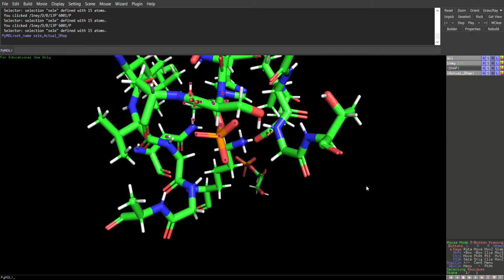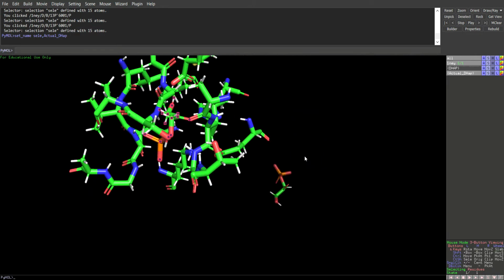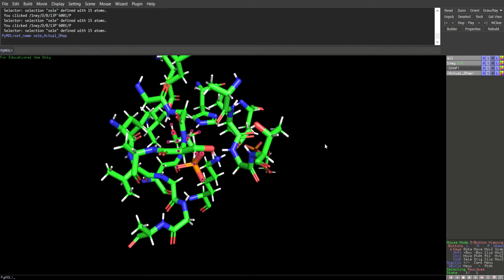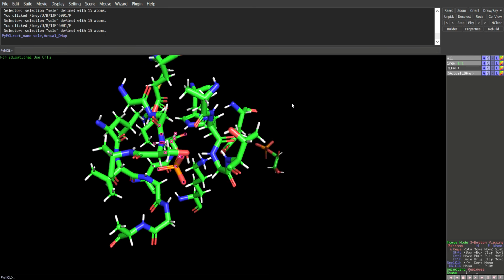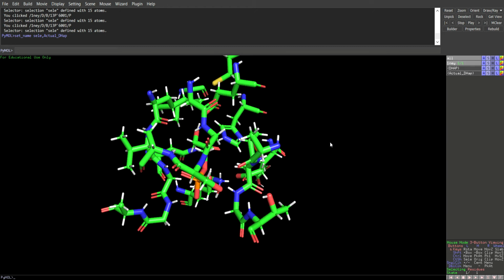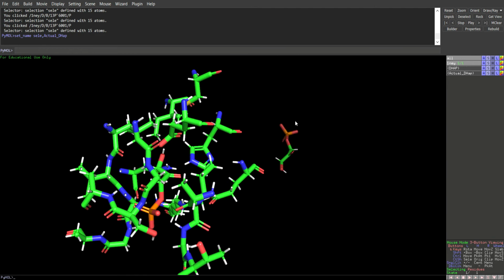So now we have all of these different amino acids, and in the answer sheet you have to find the amino acids that you think are oriented correctly and have the correct protonation. You figure that out using the chart in the first lab practical where they show the different charges of the side chains of the amino acids. Now, after that, you want to measure. That's the next part of this practical.